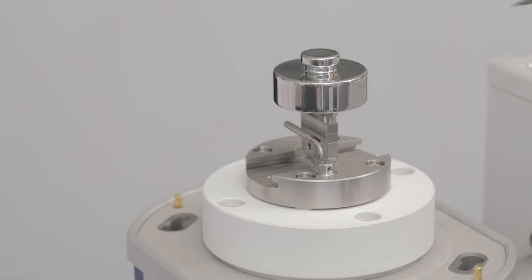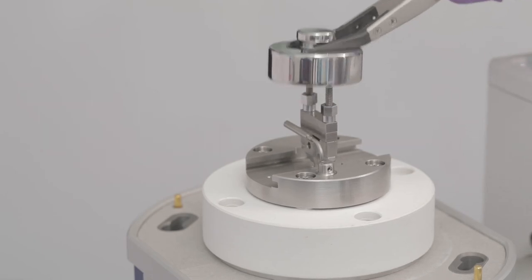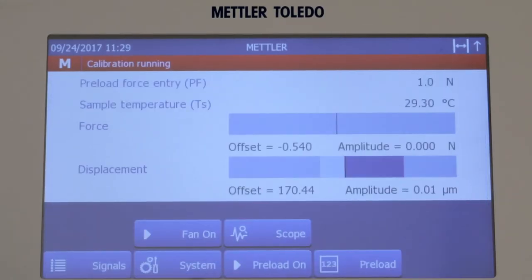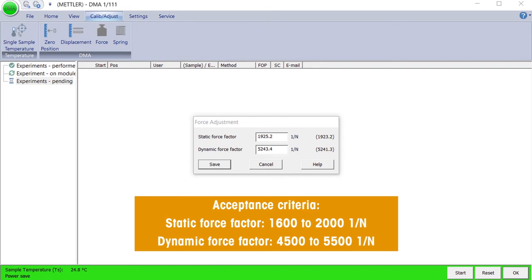Remove the reference mass and press OK. If the calculated static and dynamic force factors are within the tolerance limits, click Save to adjust the instrument.